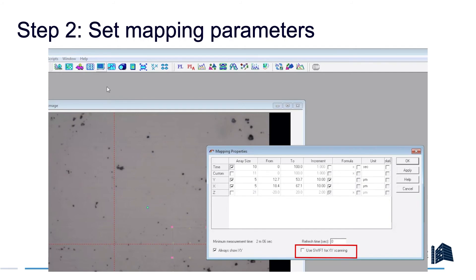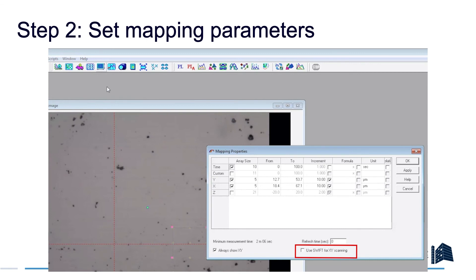This box also has a checkbox that says use Swift mapping for XY scanning. This is a mode in which the stage moves continuously instead of stopping at each pixel. This requires setting some hardware switches that we're not going to cover right now, but you can always ask a super user for instructions how to do this.